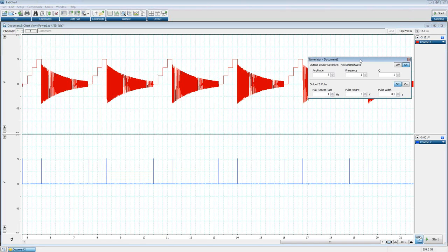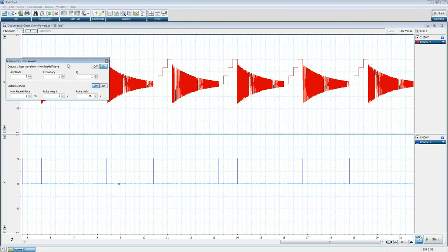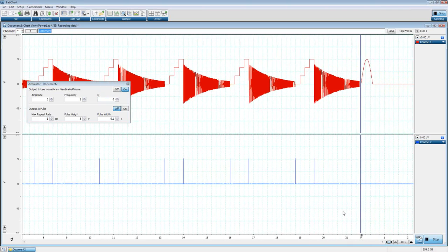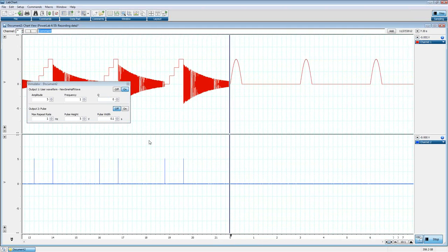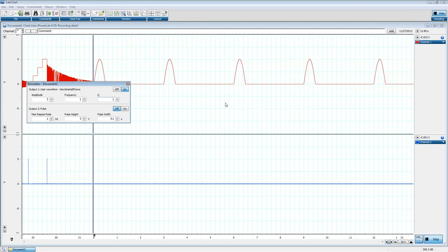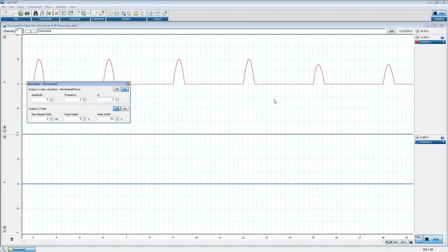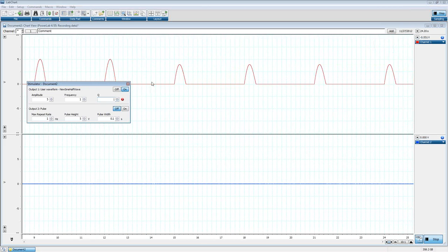We'll go up and bring our stimulator panel up. You can see here we have amplitude, frequency, and our Q, or actually multiplier of that exponential decay. So we're just going to make this 0 right here so that exponential decay won't occur. We hit start. We get our little half wave, 3 seconds, half wave, 3 seconds, half wave. I want to start decaying that, we'll say. So I go to 1. Not quite enough yet. Oh, there we go. Yep, started updating. You can see we're changing now. That exponential decay is starting to affect our half wave that we're generating.